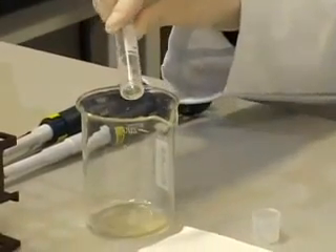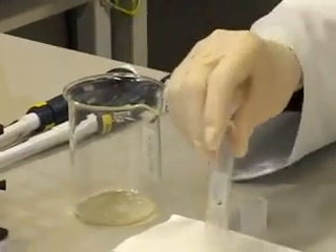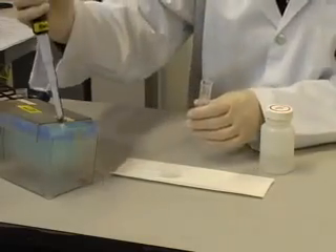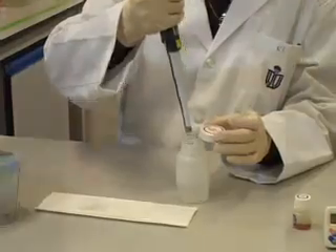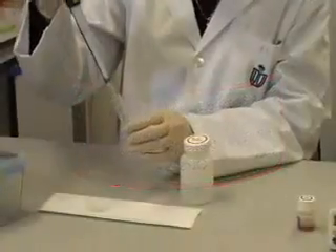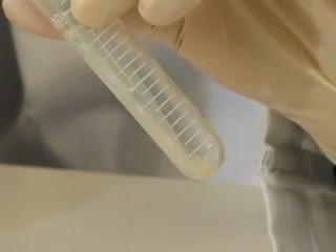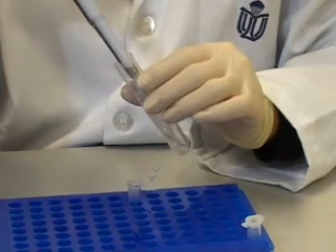Decant the supernatant by gently tapping on a piece of paper towel. Re-suspend the pellet completely in 250 µL of cell re-suspension solution by pipetting up and down, then transfer into a centrifuge tube.